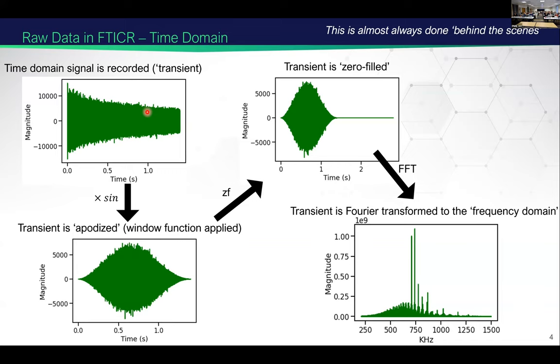Newer instruments have better ICR cell designs, which allows us to record longer signals where the ions are better controlled, so the measurement we get has higher resolution and higher sensitivity. The 12 Tesla you used has what's called an infinity cell, which is technology about 30 years old. It still works and it's still good. But about 12 years ago, a new type of cell was designed called the dynamically harmonized cell, and that's what's inside the 7 Tesla instrument. It compensates for electric and magnetic field inhomogeneities much more efficiently, which again improves our sensitivity and resolution.